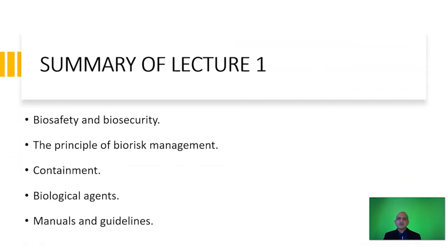This brings us to the conclusion of the first lecture. In this lecture, I have introduced you to the principles of biosafety and biosecurity. Biosafety is based on the unintended release of a biological agent. Biosecurity, on the other hand, is based on the intentional release of a biological asset. I have introduced you to the basic principle of biorisk management which is based on the AMP model: risk assessment, risk mitigation, and performance assessment. I have also introduced you to the principle of containment, biological agents, and some of the manuals and guidelines. In the next lecture, I will introduce you to the laboratory management system.